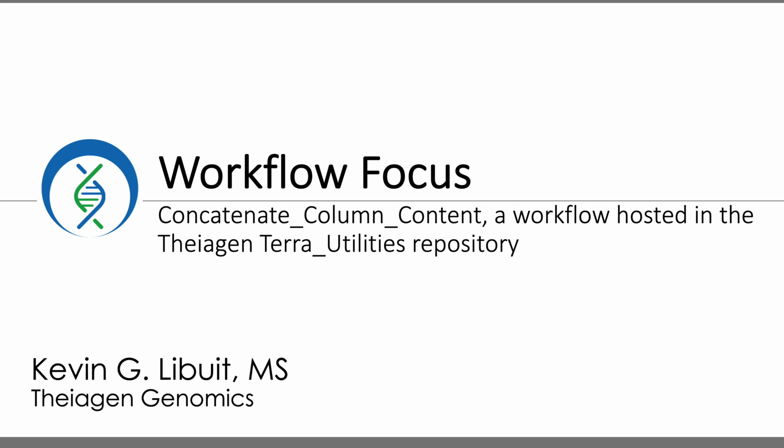And the Concatenate column content workflow allows users to select an output value for multiple samples, combine them or concatenate them into a single downloadable file. And this was written with the assumption that users will be concatenating FASTA assemblies into a single multi-FASTA file. But you can really use this for any file that you wish to concatenate in your Terra workspace.